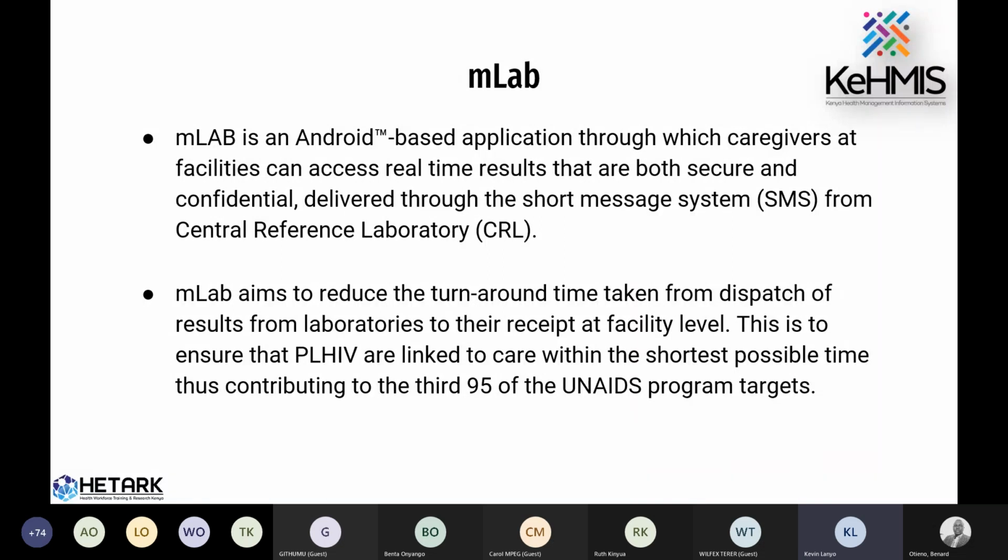And its main aim is to reduce the turnaround time taken from dispatch of results from laboratories to their receipt at the facility level. This then ensures that people living with HIV are linked to care within the shortest possible time, which eventually contributes to the third 95 of the UNAIDS program targets.